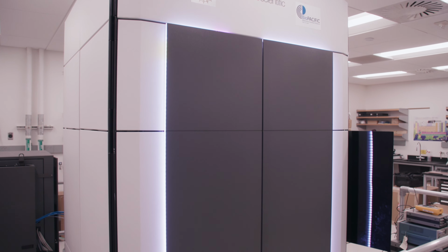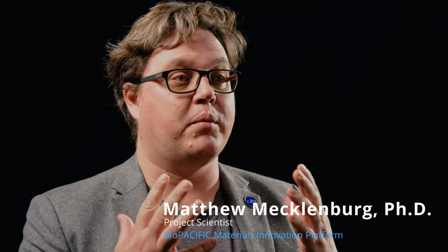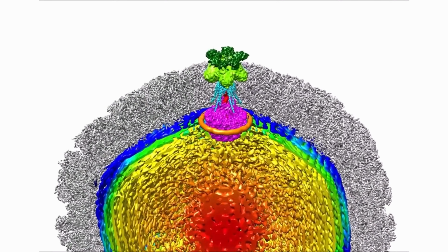Electron microscopy uses an optical microscope design, but a wavelength 100,000 times smaller than visible light. Transmission electron microscopy is the only technique that can directly image viruses and proteins in 3 dimensions. It is the predominant method for imaging the intricate interfaces in state-of-the-art semiconductor devices. It is the only imaging technique that can get to the subatomic resolution in 3 dimensions. This type of microscope is intertwined with our daily life.